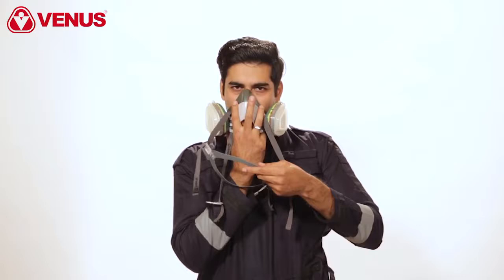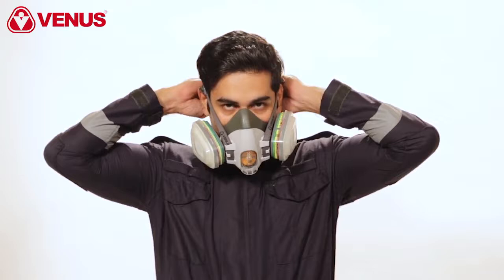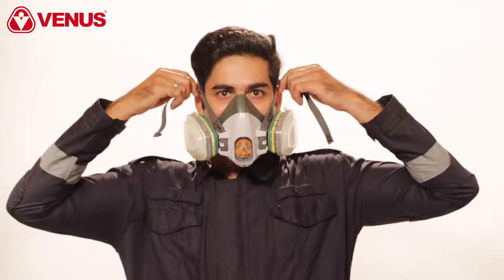Place the respirator over your nose and mouth, fitting it comfortably on the bridge of your nose. Then pull the head harness over the crown of your head. Take the bottom straps in both hands and hook them together behind your neck. The respirator should fit snugly against your face, but take care not to over tighten. Ensure the straps have not become twisted.